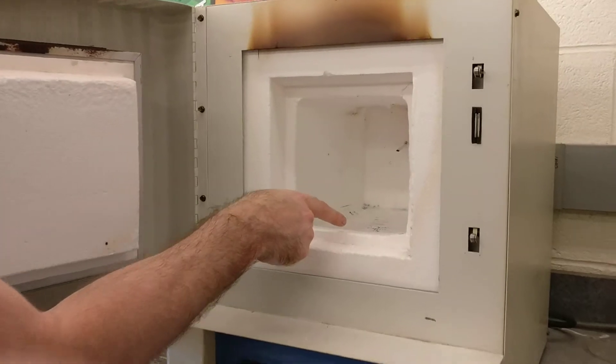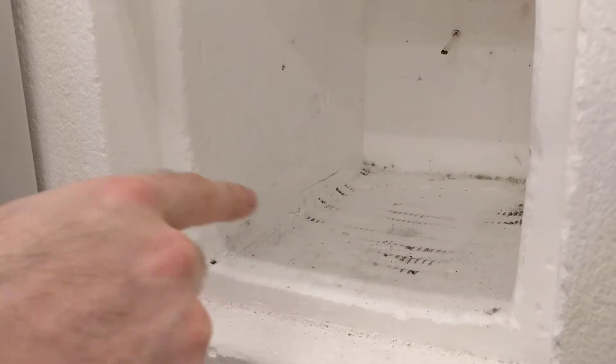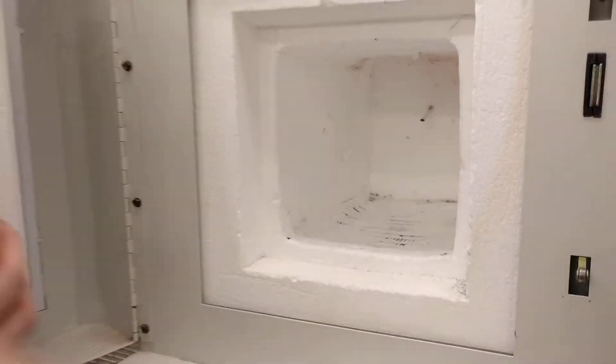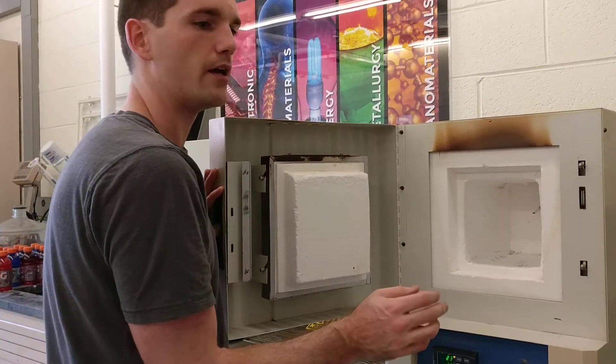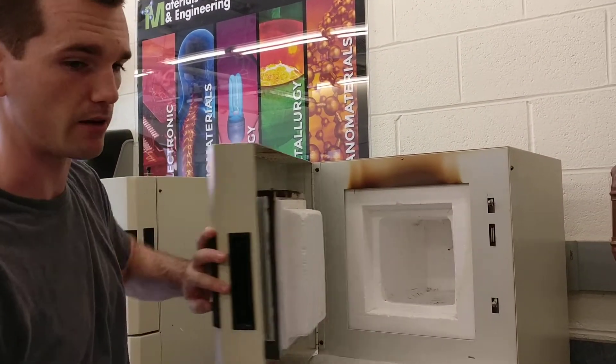You'll also notice the heating elements that are kind of sticking through on the wall. There's heating elements all around here, but there's none on the door of this one. While the furnace is on and applying current to the heaters, you don't want to touch those heating coils with anything metal.